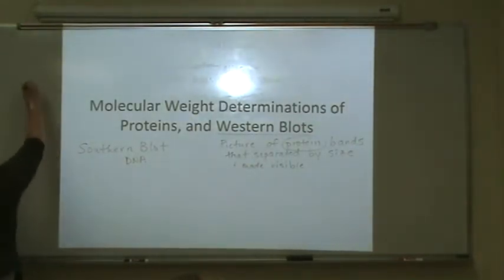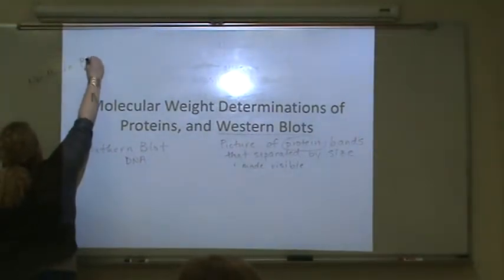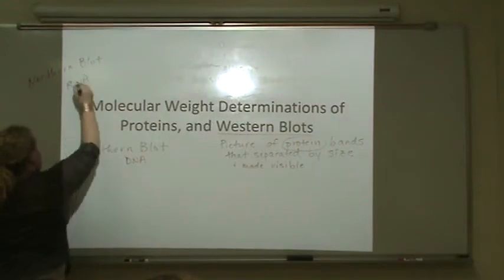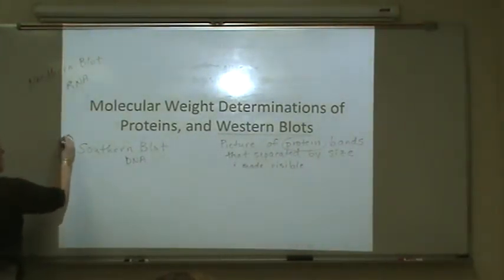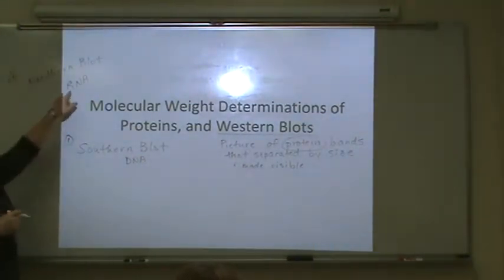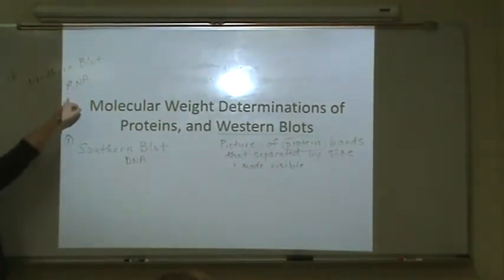If you hear of a technique called a Northern blot, it is this same thing, but using RNA. So Southern blot was the original method of this type that was developed. Someone then tried it with RNA. Remember, RNA is single-stranded and less stable and more finicky. So this technique came second, and they called it Northern because it's the opposite of Southern, because you're doing RNA work.